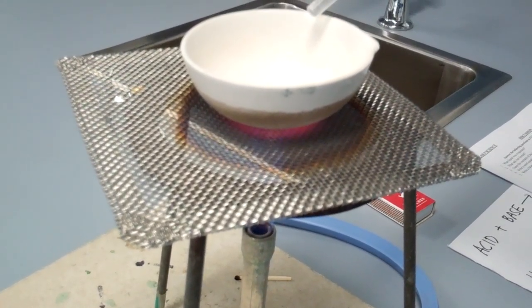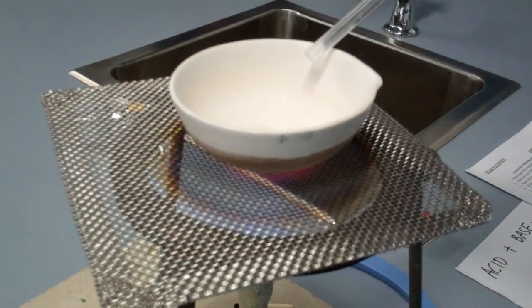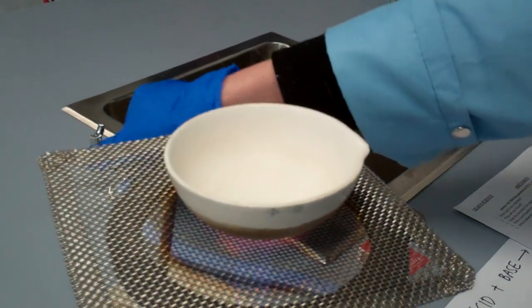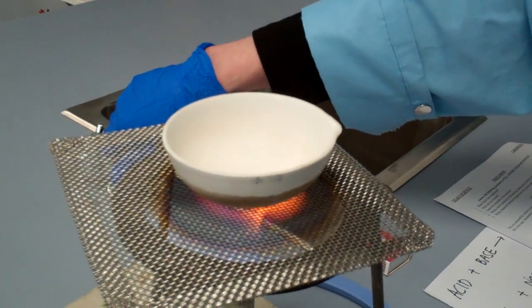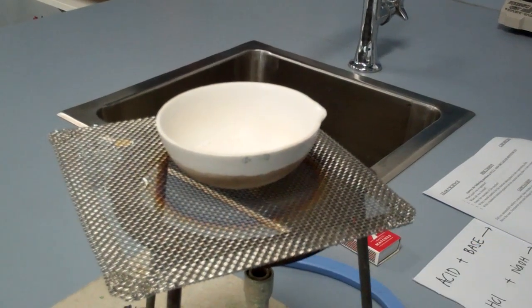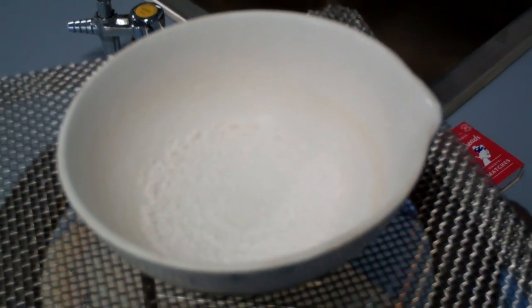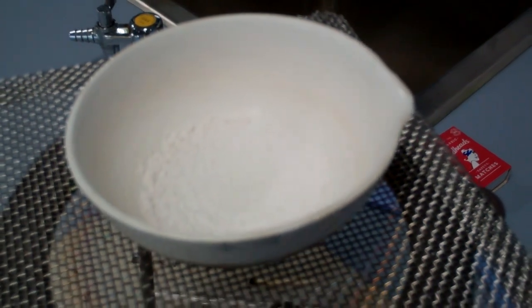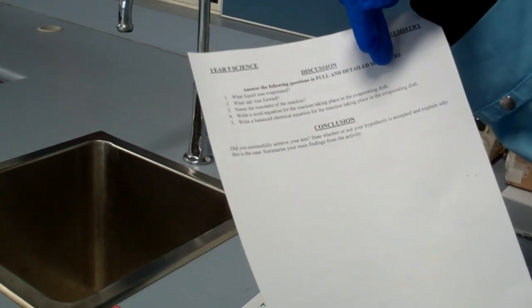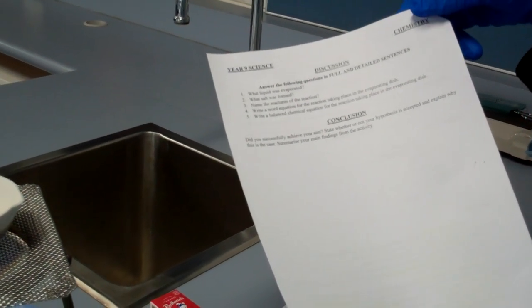Now most of the solution has evaporated, and you can see more salt forming. I'll just turn the Bunsen burner off and I'll show you the solid. If you look inside the evaporating dish, you can see quite a bit of salt forming, and that is your sodium chloride. The rest of the questions are just asking you to write a word equation for the reaction that is taking place in the evaporating dish, as well as write a balanced equation for the chemical reaction. So that's all.